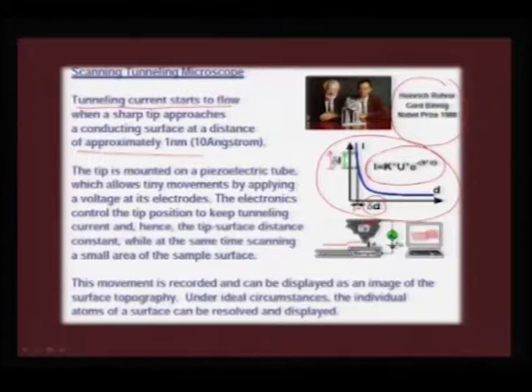If you have an insulating compound or a biological sample, then you need to come up with another probe which will help you do the same atomic level mapping, and incidentally that is what AFM is able to do. Atomic force microscope is mainly meant for non-conducting surfaces. So, we will go into more detail as we progress through this lecture.